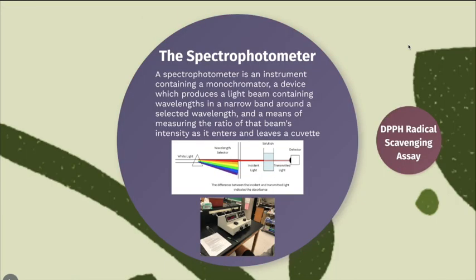All our antioxidant assays were colorimetric. The results could be determined by changes of color in a solution. We used a spectrophotometer to make accurate measurements of these color changes.